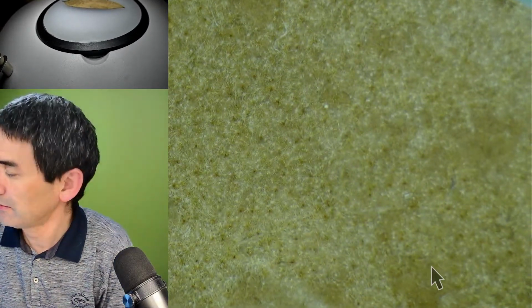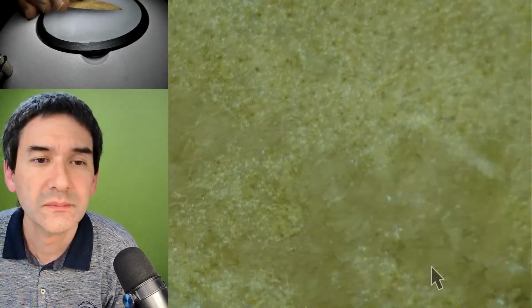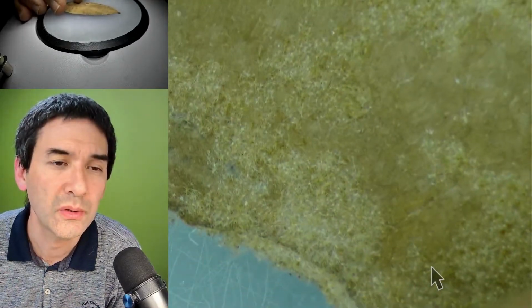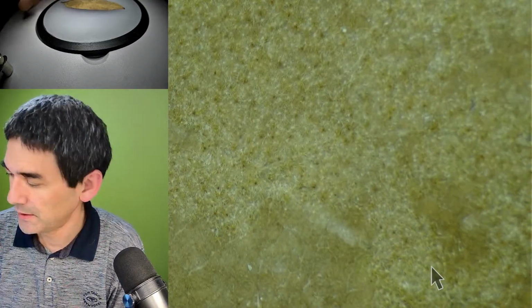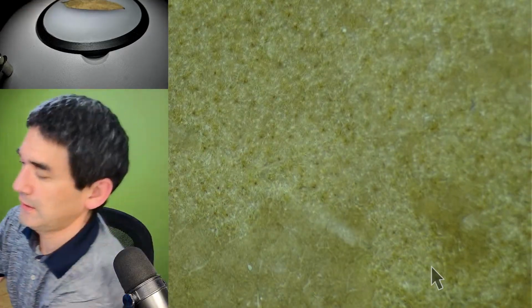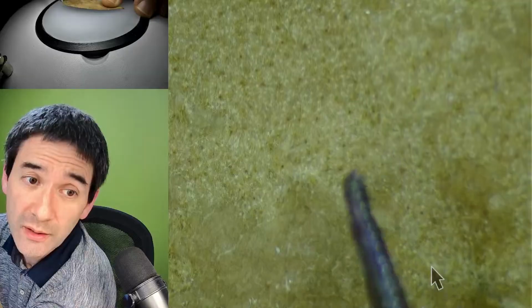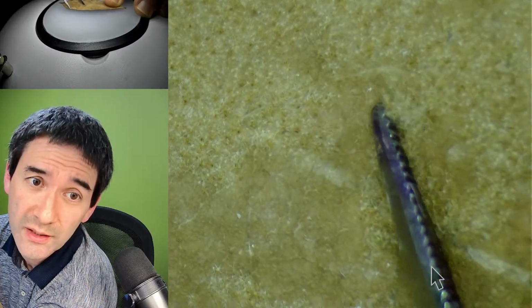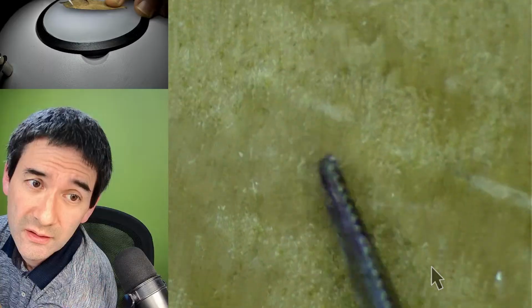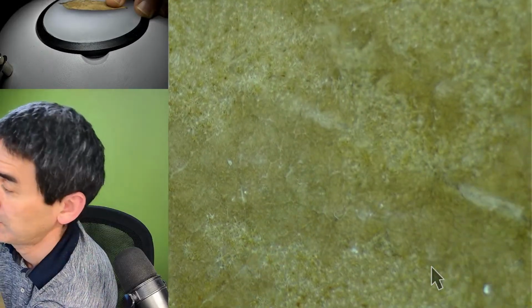But you see, the contrast is too low. But I'm going to try the following. Maybe you're able to see that there's this fuzzy thing, right? Yeah, you can actually see it much better now.